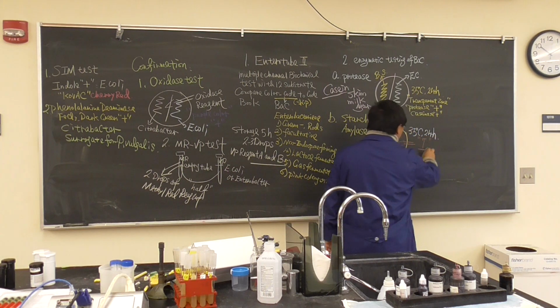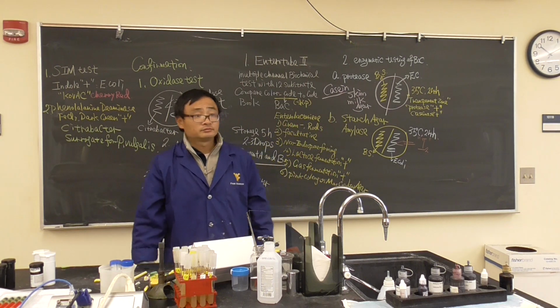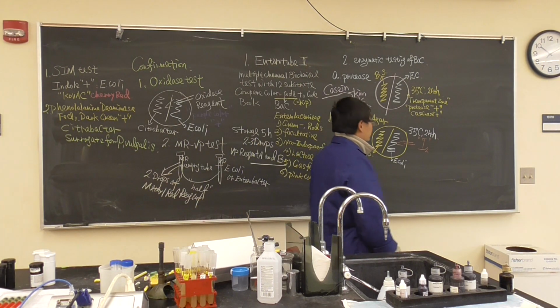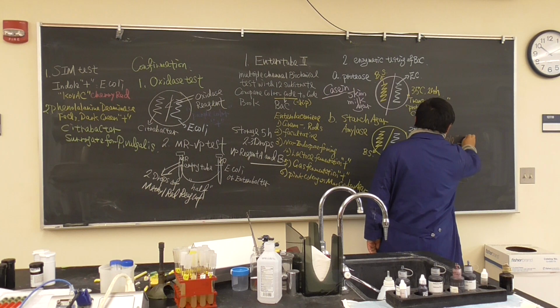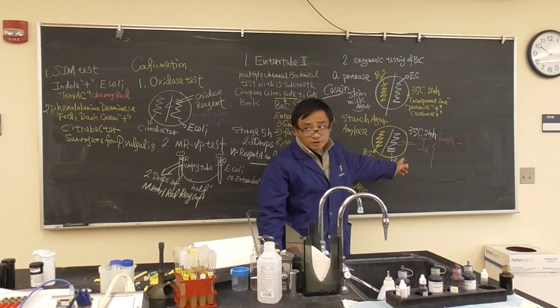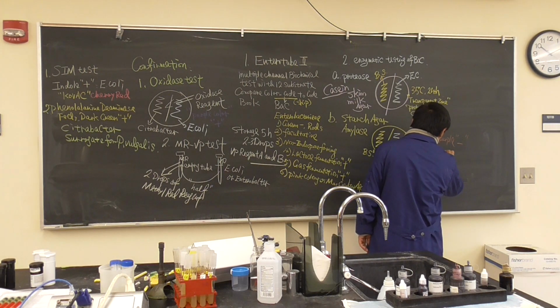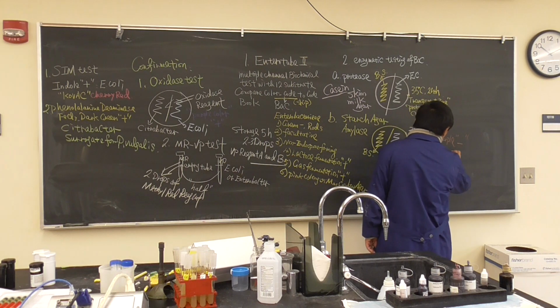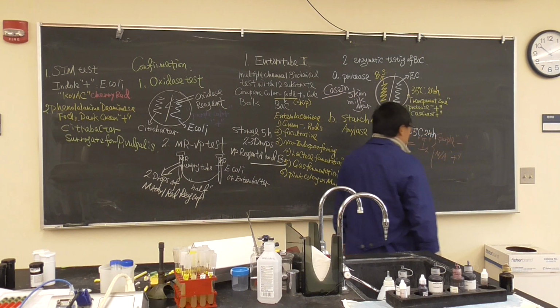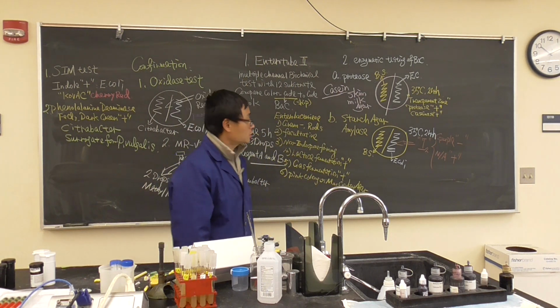Iodine. Is that right? Starch will react with iodine. So if you see one side the color is still purple, which means it's negative, because starch is still there. If you see the other side, there is no color change. Oh, sorry, all the color is changed. Then it is positive, because the starch is breaking down by amylase. So we need to do a confirmation test.